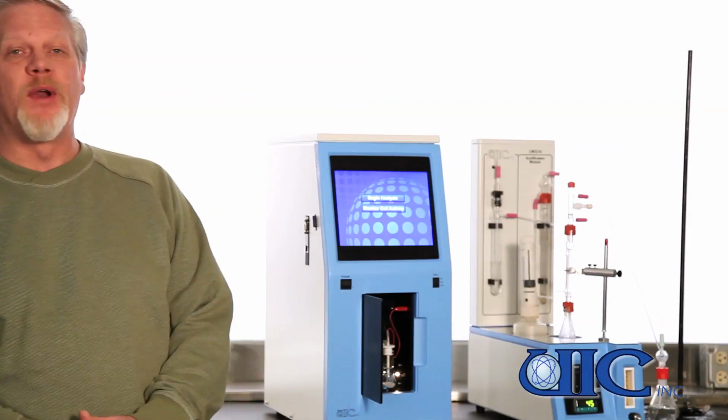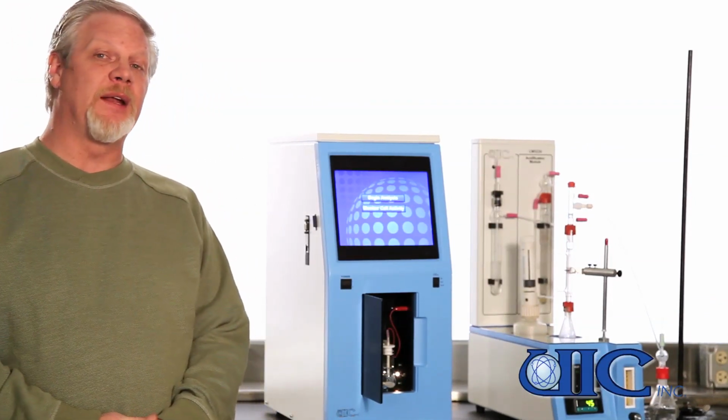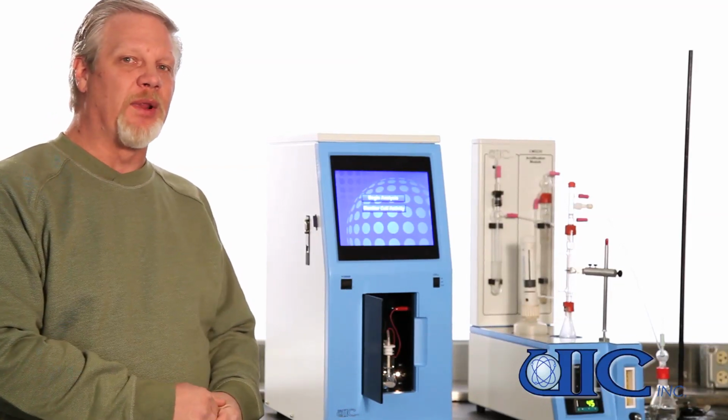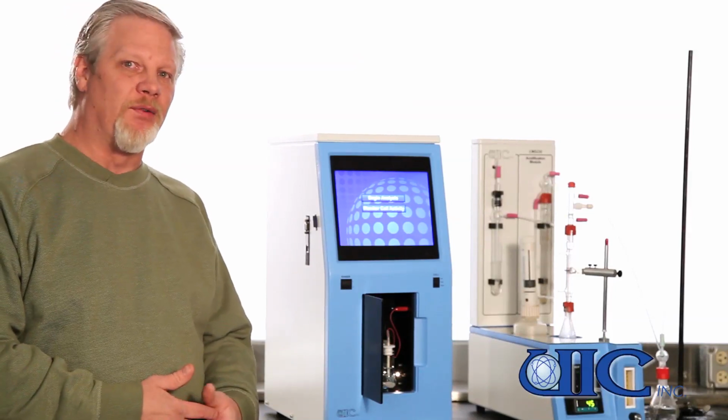If we use the word blank, it won't ask us for a sample size. We now have the choice to either begin analysis or monitor the cell activity. Since the acidification module has been sealed and the sample flask has been on for quite some time, we really don't need to monitor for any purge.